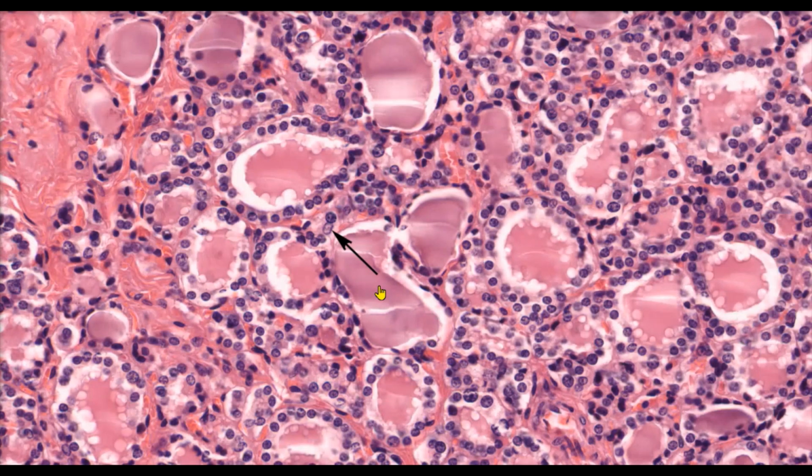All right, the first thing that we notice is that we can see all of these thyroid follicles. Notice how the follicles all vary in size, but each displays this central lumen or opening area that's filled with a pink kind of gel-like substance. That gel-like substance is called colloid. Each follicle is lined by a secretory epithelium, which we can see right here. So that's going around that pink gel-like colloid.